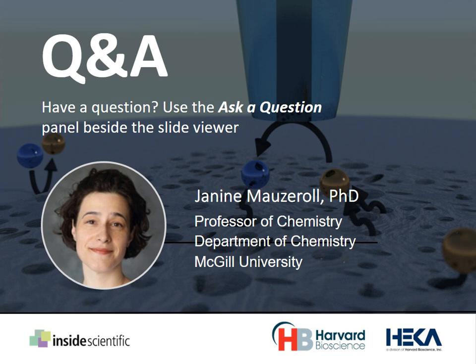Well, for sure there is a difference, and for NMC particles that tend to have larger aggregates, yes, you don't get the same response. Like the current will be different.